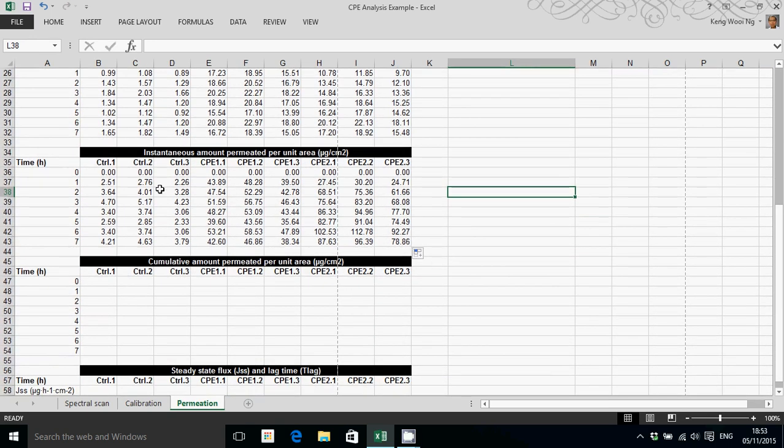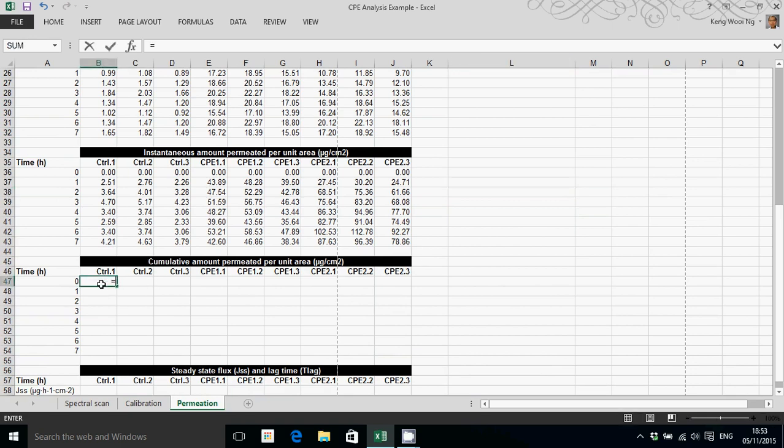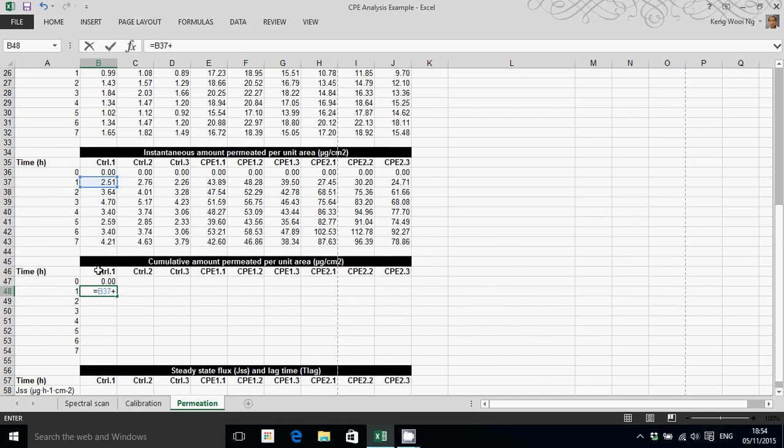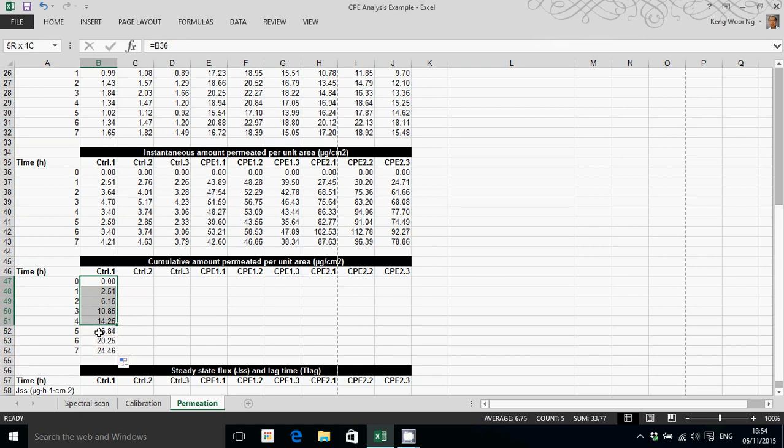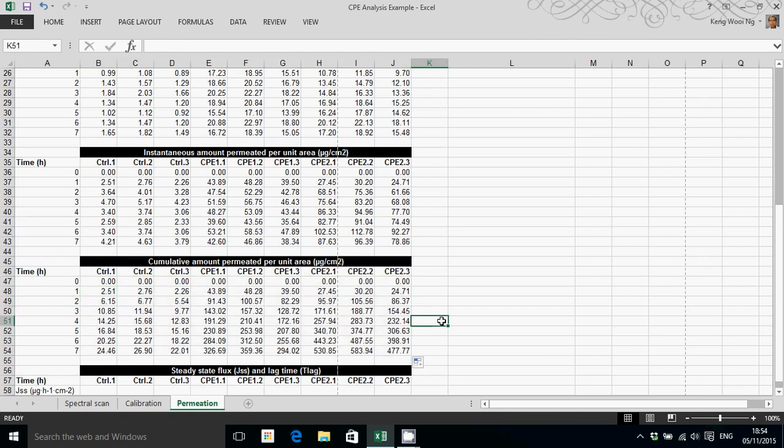Now the next step is to convert instantaneous data into cumulative data. Now in order to do that, for the first time point, we simply take the instantaneous value as it is and put that into that cell. Then for the next sampling point, we would take the corresponding instantaneous amounts and add the cumulative amount that came before it, and do that for all of the samples. So that gives you the cumulative data.